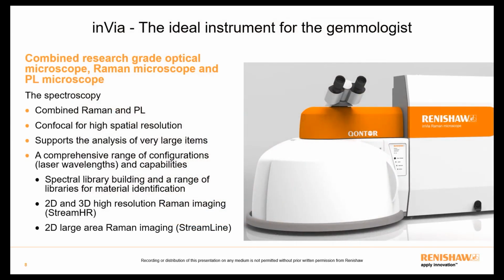We've seen how Raman and PL spectroscopies are combined together. Because these are used with a confocal optical microscope, we also have high spatial resolution in X and Y and high confocality in Z. Particles of 1 micron in size or smaller can be analysed as a result of this, and there is a lot of flexibility in the sampling volume.